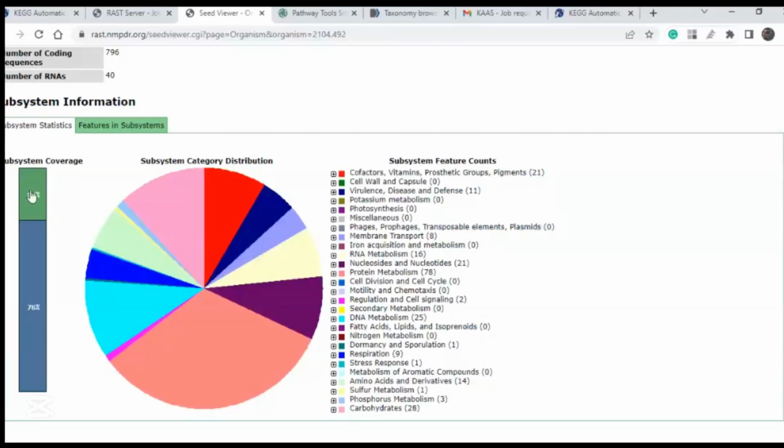And 24% of the genes, this part of the genome, are included in the subsystem feature counts. Right? And then the 76% are not in the subsystem, but they are also annotated. And 247 are non-hypothetical, and hypothetical are 363 genes. Here, 184 are non-hypothetical and 2 are hypothetical genes. Total 186. So a smaller number of genes are classified as subsystem features.